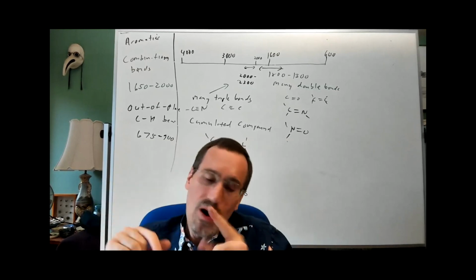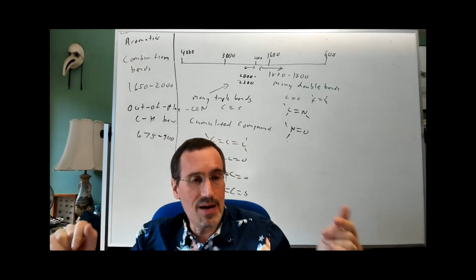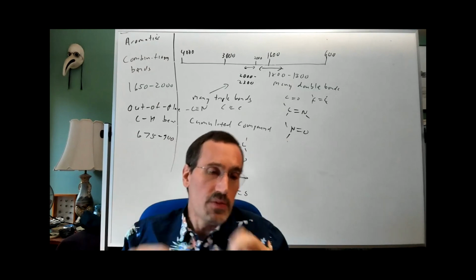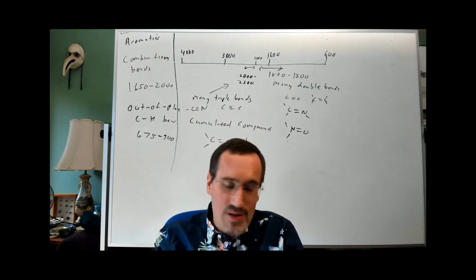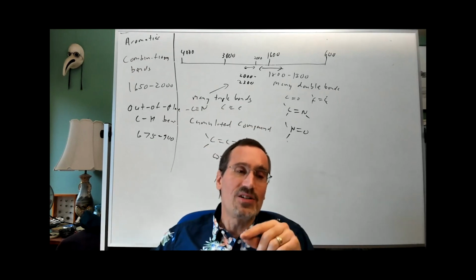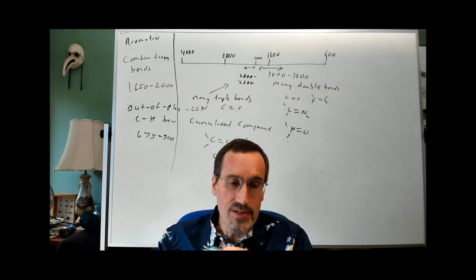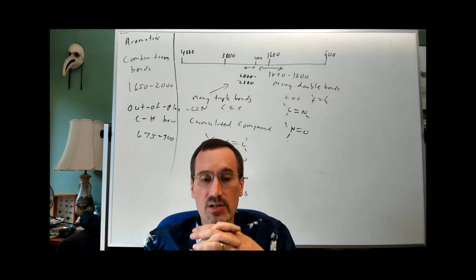And so you say, oh, okay, is there a carbonyl? No, there's no carbonyl. Okay, is there a carbon-carbon double bond? Oh, there's no evidence of a carbon-carbon double bond. Maybe I have a ring in there. So it helps you start to focus your thinking. Or conversely, you may look and say, if this compound does have a degree of unsaturation, it's a ketone or it's a carbonyl compound. I know it can't have a ring. So I know it's got to be a linear compound. So those would be things that would be very useful to know as you're starting to fathom your structures.